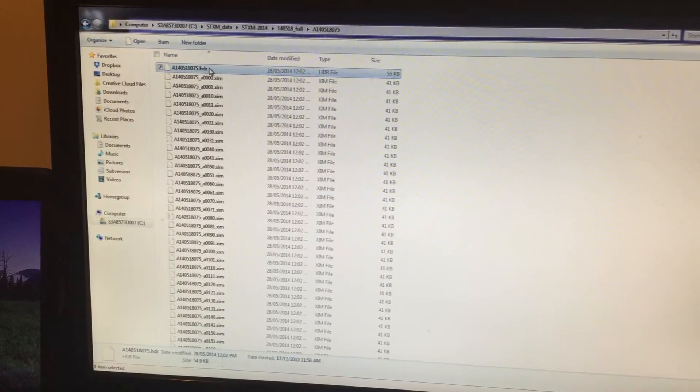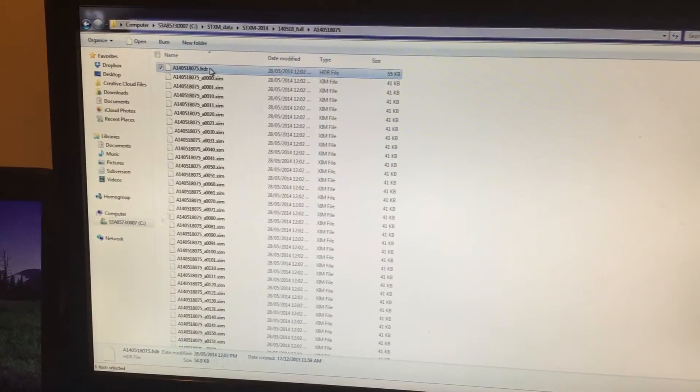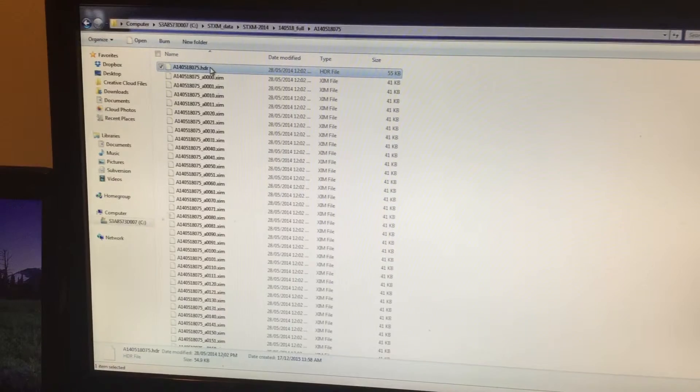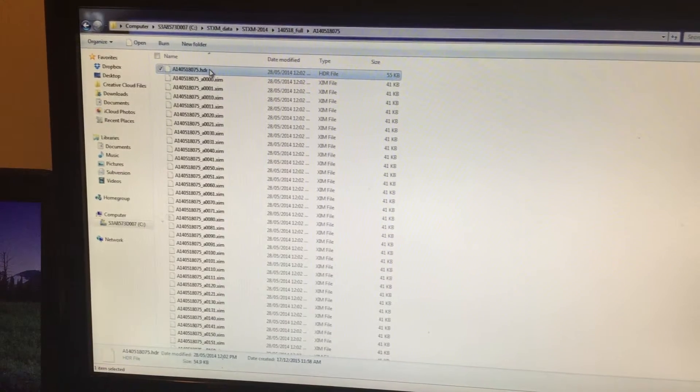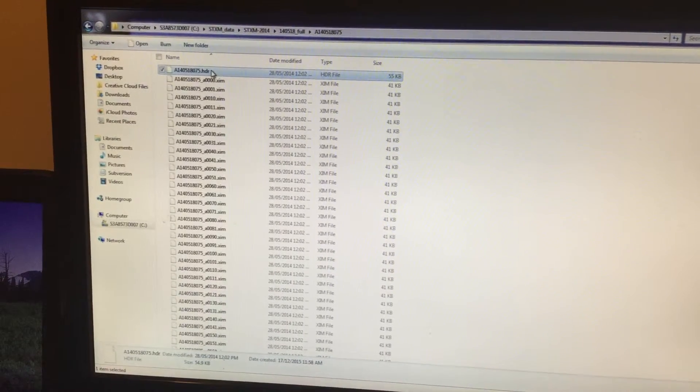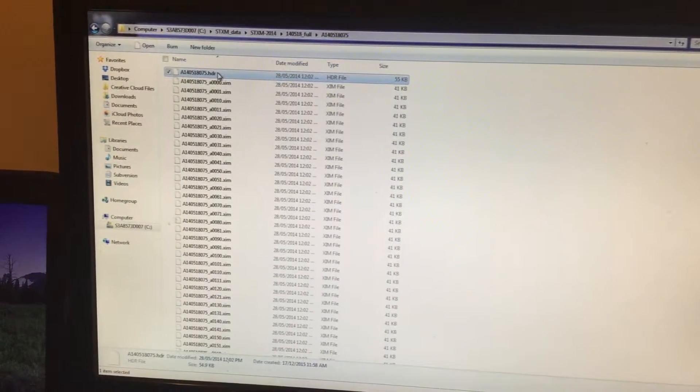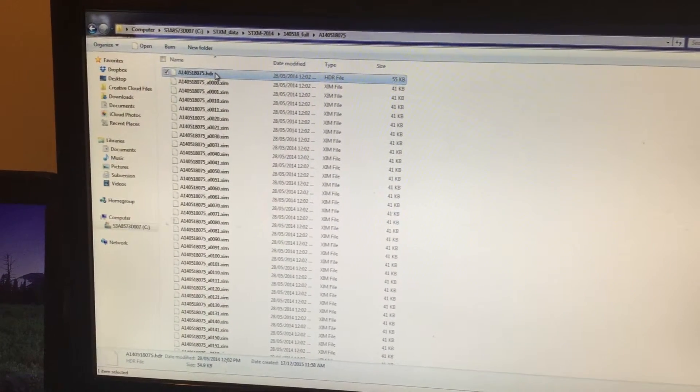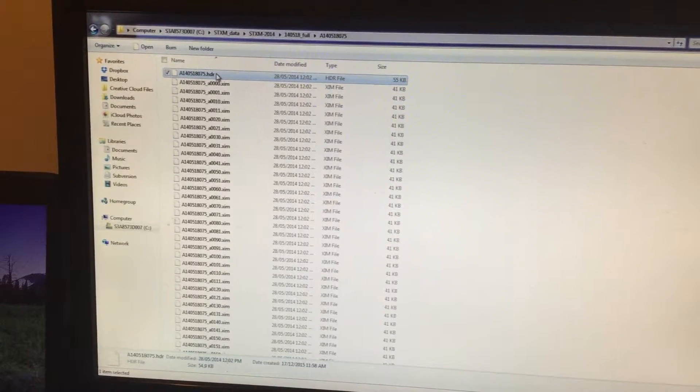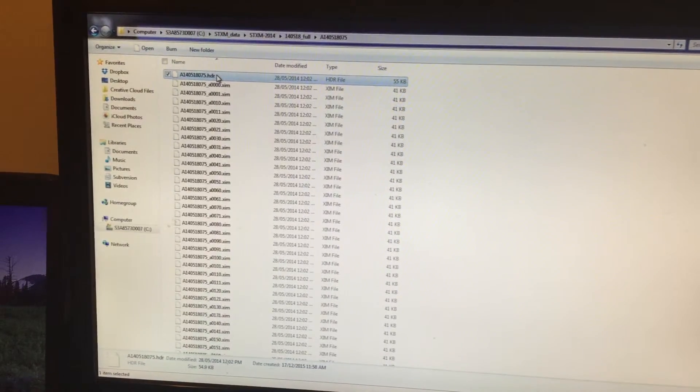I'm going to show you how to get the final X-ray absorption spectra using Axis 2000 software.